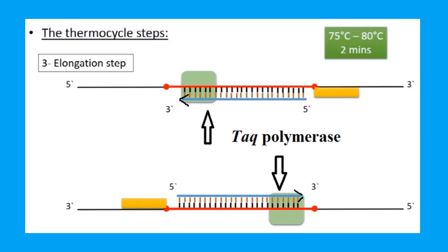After both primers are matched, these primers need to be extended, each one on one of the two separated DNA strands. New nucleotides are added to build up a complementary strand to the first and a complementary strand to the second DNA strand, at the position of the hydroxyl group at which new nucleotides are added to the primer.